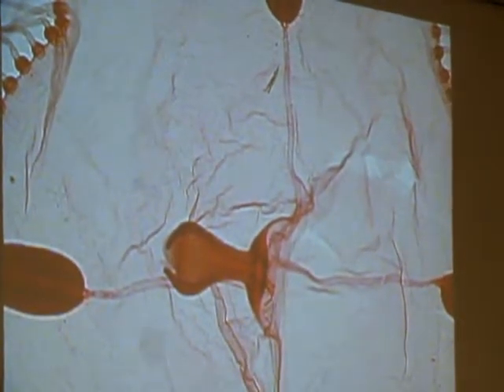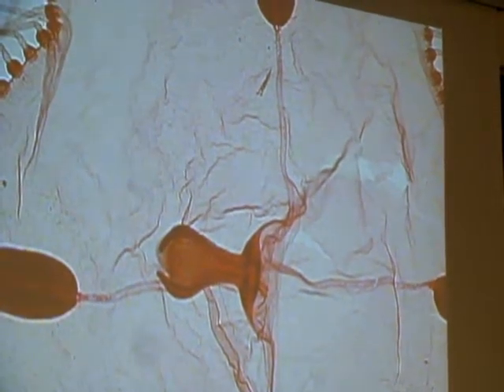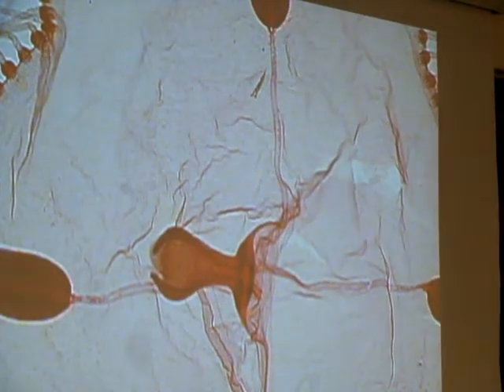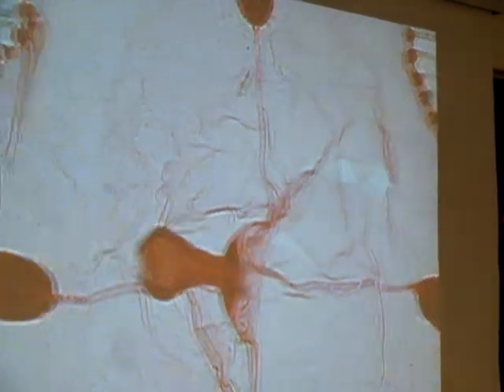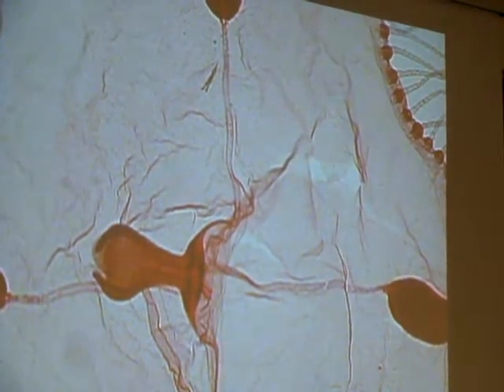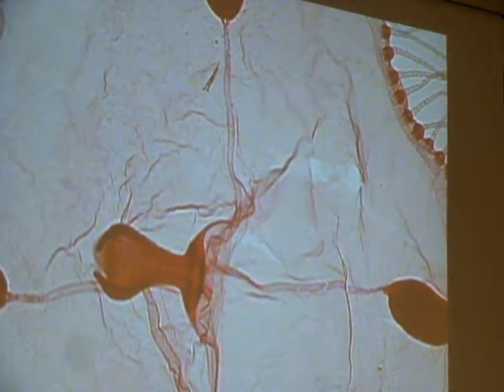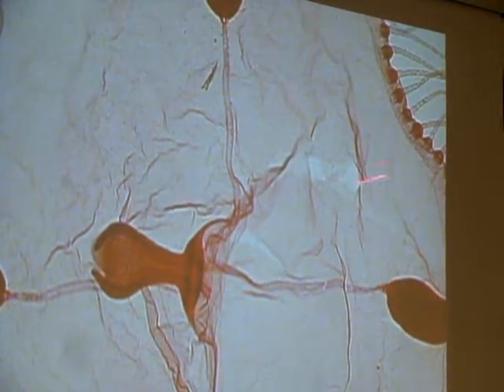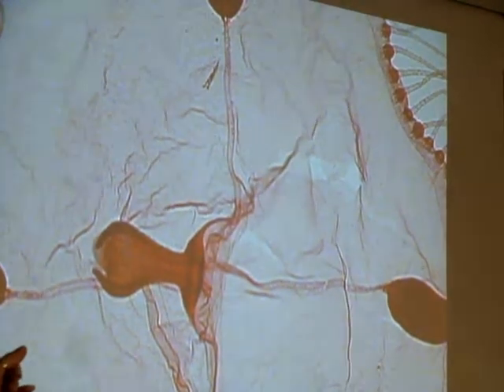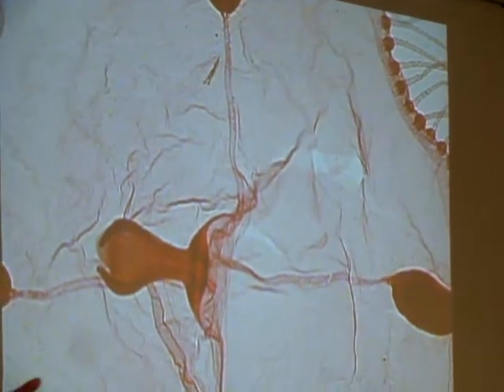Name this organism. Oh, that's a mouse. Hydrozoa. So we looked at the other hydrozoa with the two types of polyps, feeding and reproductive. Eventually, those medusa buds will swim away, and this is the medusa. So if I ask you general body plan, medusa or polyp, y'all? Medusa.